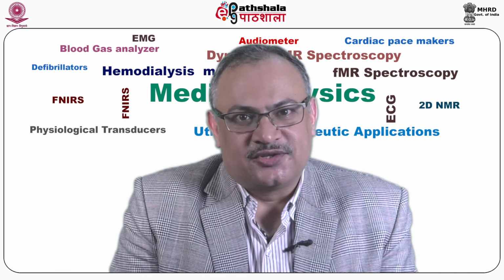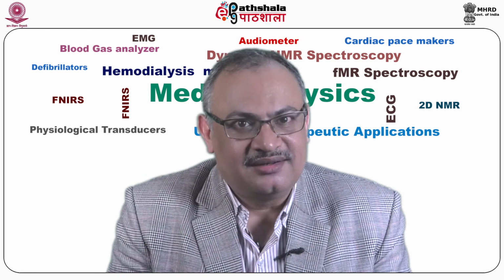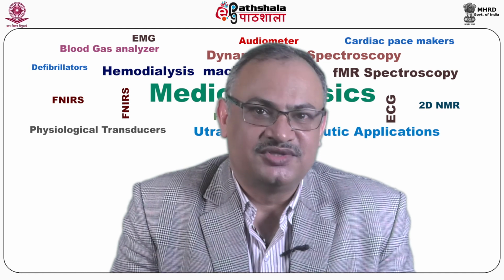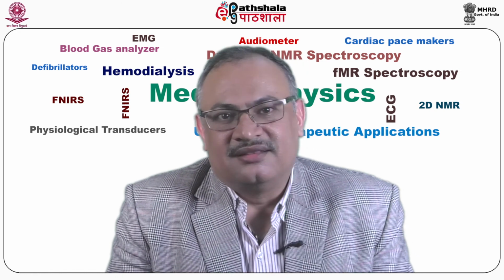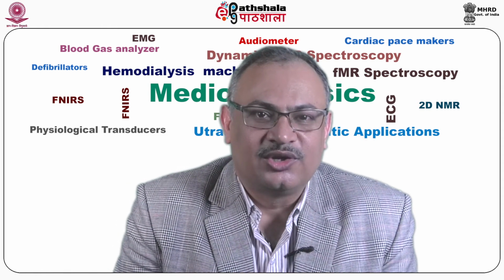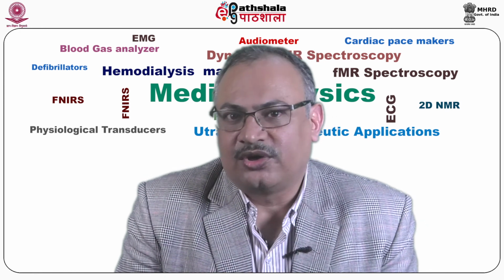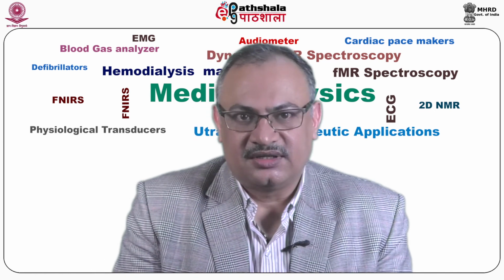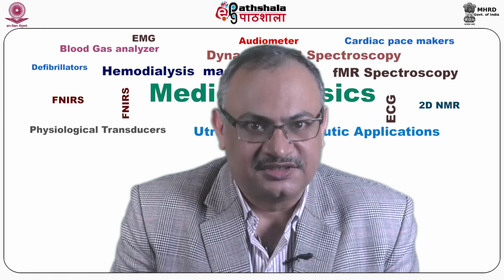Next, Bloch developed his theory in terms of surplus of spin in a bulk system, or nuclear polarization, which is both parallel and proportional to the applied homogeneous magnetic field. To a stationary sample in a homogeneous magnetic field, Bloch applied a perpendicular alternating radio frequency field. This led to an alternating magnetic field which could generate electromotive force in a suitably wound coil. By rectification and amplification, this EMF could be recorded on a voltmeter with the signal in the range of millivolts. Bloch contributed the famous Bloch equation and the theory of relaxation to NMR spectroscopy, about which we will learn further.